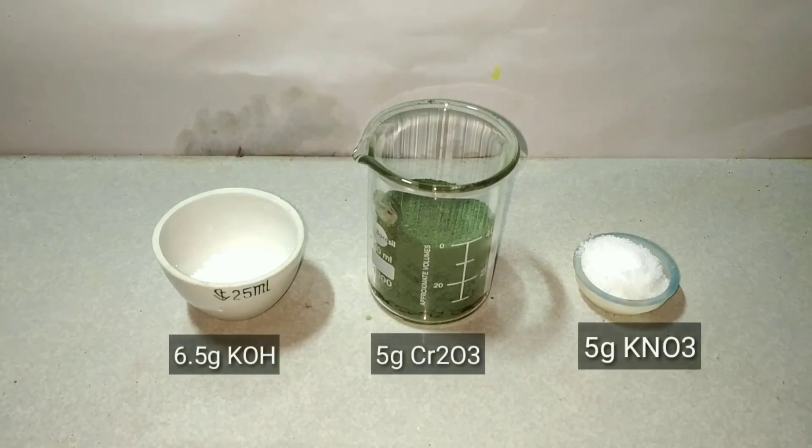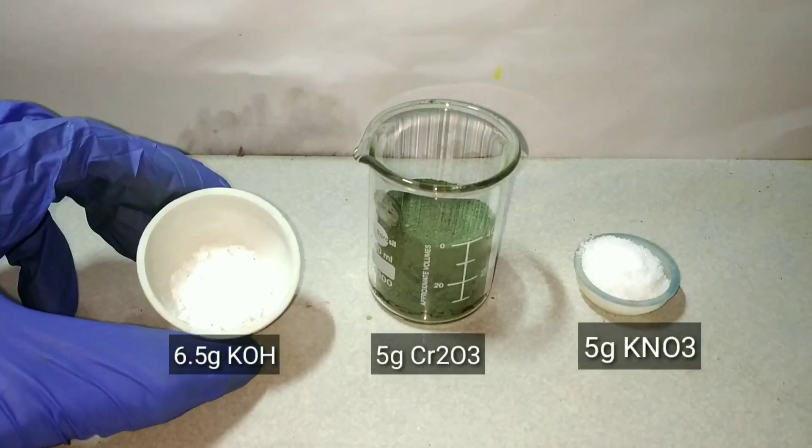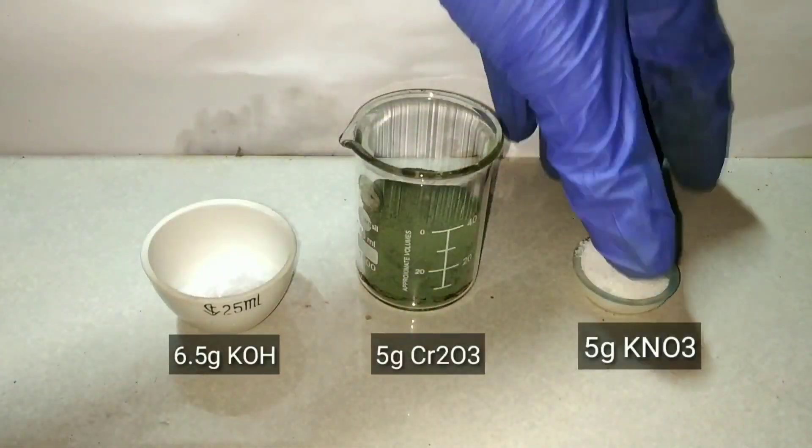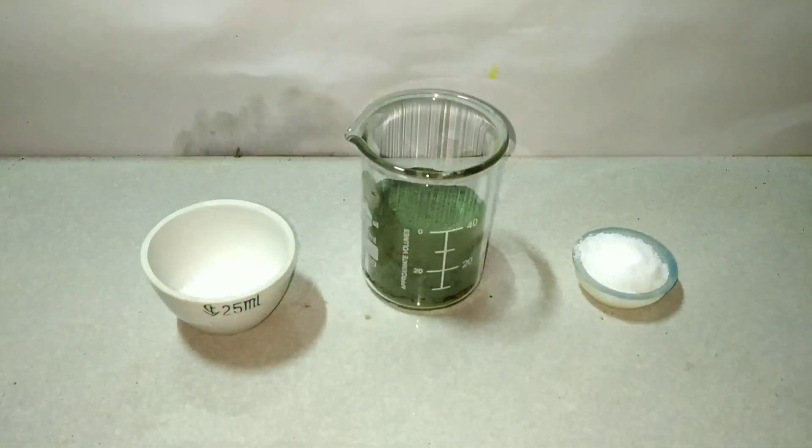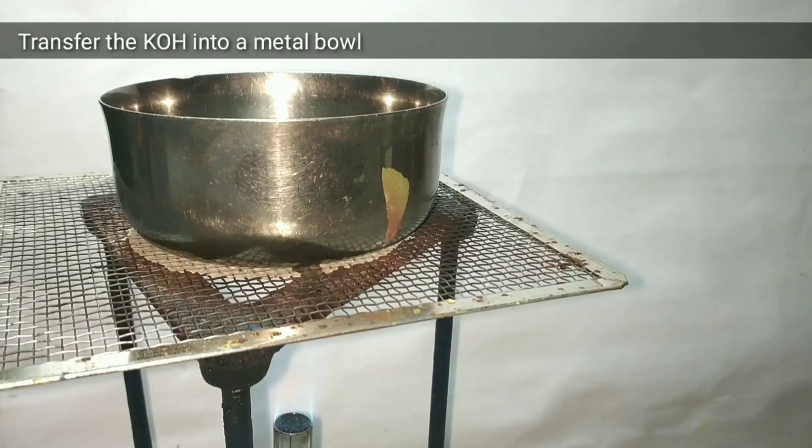I wash the chromic oxide to remove any unreacted dichromate crystals. For this synthesis we need 6.5 grams of potassium hydroxide, 5 grams of chromic oxide, and 5 grams of potassium nitrate.